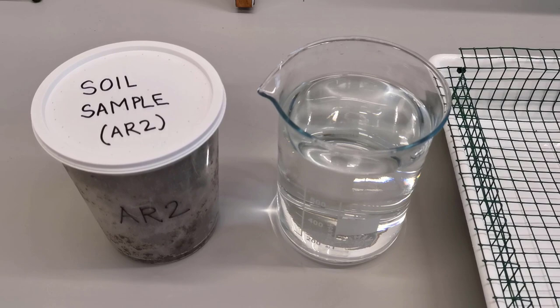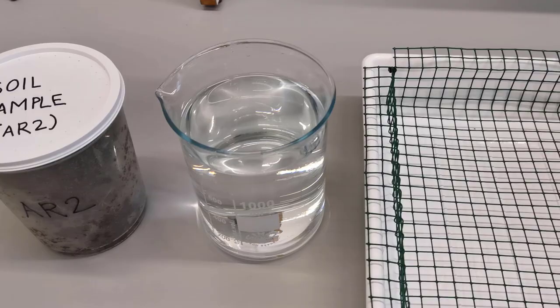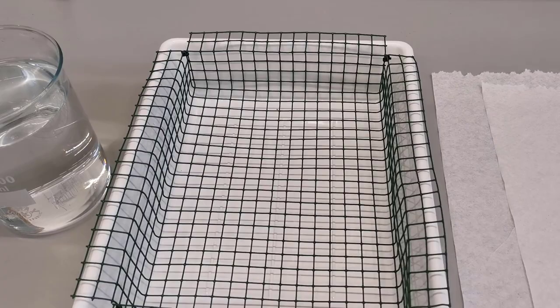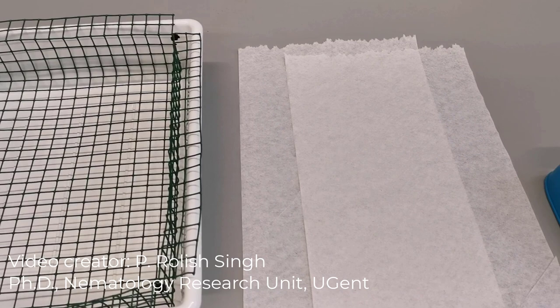Vermiform motile nematodes from soil can be easily extracted by a simple experimental setup which requires a plastic tray, a supporting wire mesh, some tap water and a few tissue papers, and other minor requirements such as beakers, leveling materials, etc.